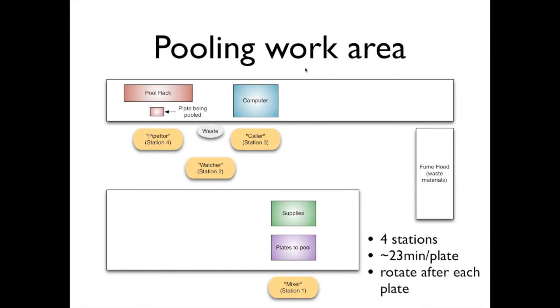We started initially looking at robots and exploring robots, talking to various manufacturers. We found that we could start around $80,000 with a basic robot system and then work from there up in multiples of tens of thousands to try to adjust to give the flexibility that we would need for the pooling method that we had in mind.